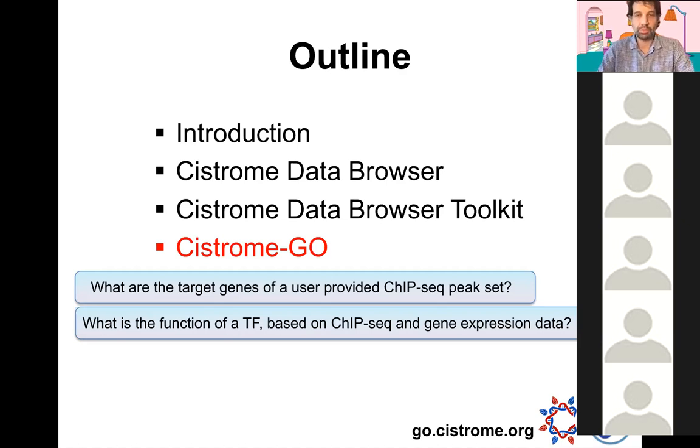And in the future, maybe we will also search for similar data sets. Say you have a single cell ATAC-seq cluster, based on that we could figure out what different ChIP-seqs are binding in that cluster using the imputed data, but this will be a later feature. Very good, thank you. Okay, great, thanks.